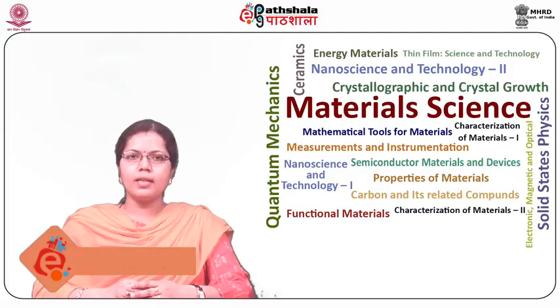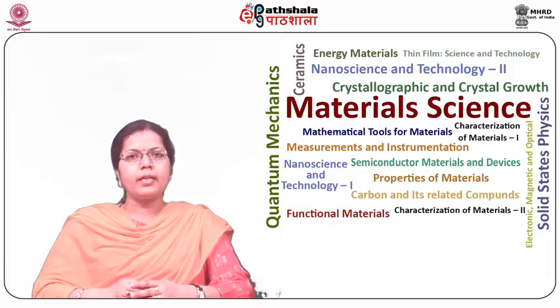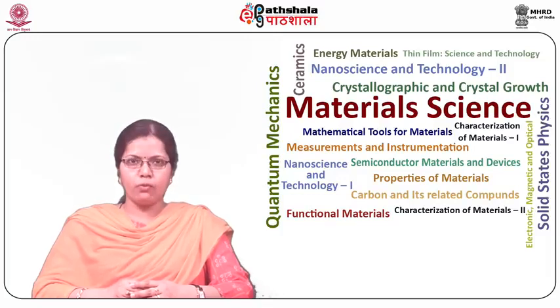Today we are going to discuss the module Optical Microscopy: Optical Microscopy Techniques, Bright Field Optical Microscopy, and Dark Field Optical Microscopy, from the paper Characterization of Materials Part 1.